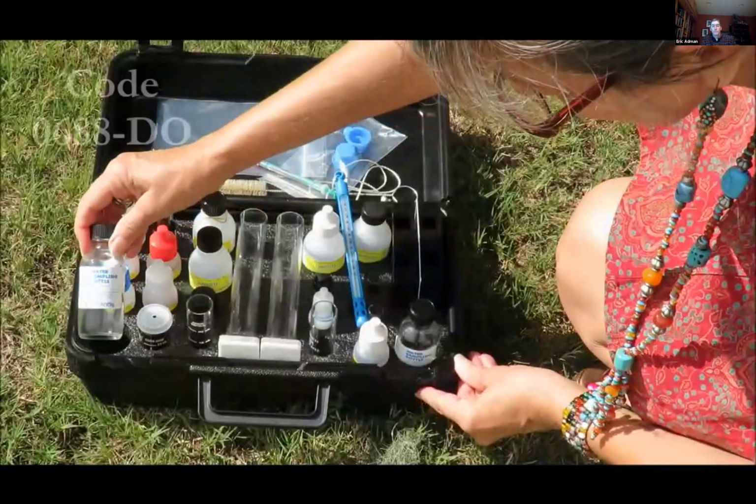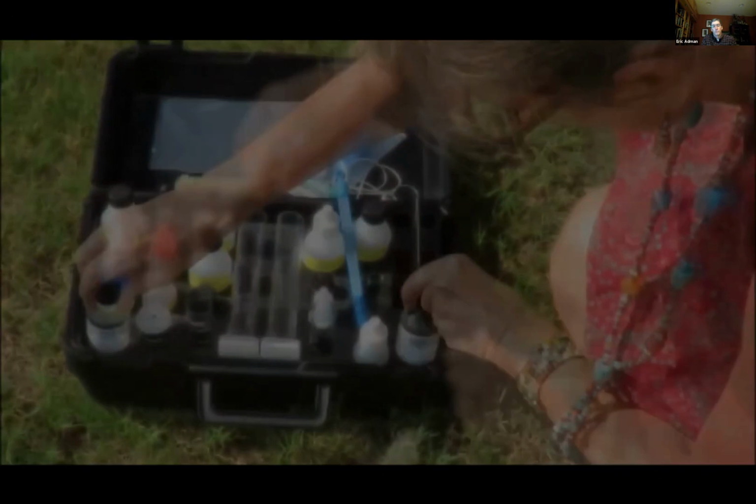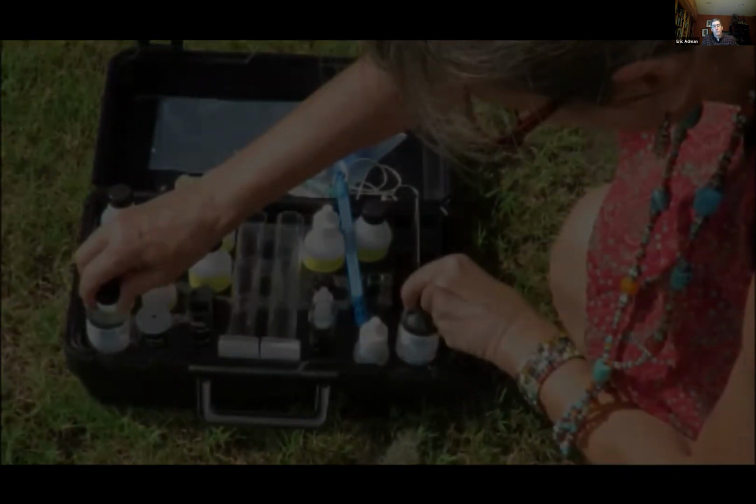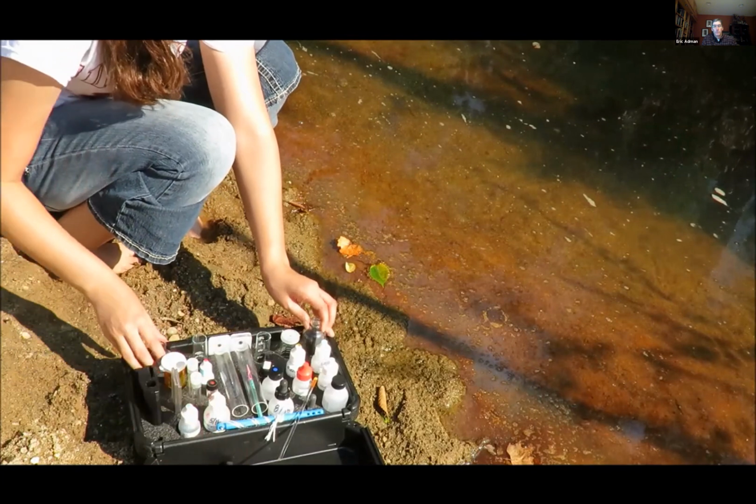For this step, you will need the 2 water sampling bottles from your kit. 2 replicate samples for dissolved oxygen must be taken to ensure precision. Replicates are 2 samples collected at the same time and place. You will use both water sample bottles in your kit. Uncap the bottles and rinse 2 to 3 times with water from your site.